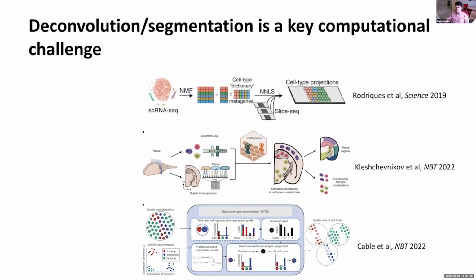And then I'll just conclude, because I know Faye has also mentioned this already. A key question is how to deconvolute these data. And so we're really fortunate that there are a lot of really great techniques out there that allow us to look at the quantification of the mapping of individual single cell profiles onto these cell types. And now there are also emerging methods that allow us to look at gradients of expression across these features as well.